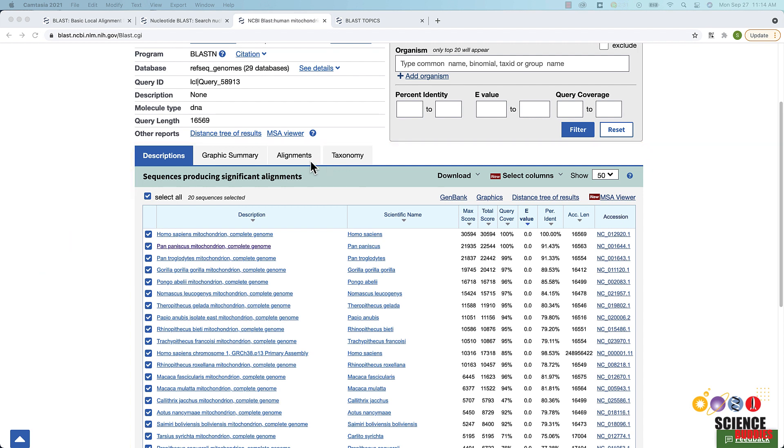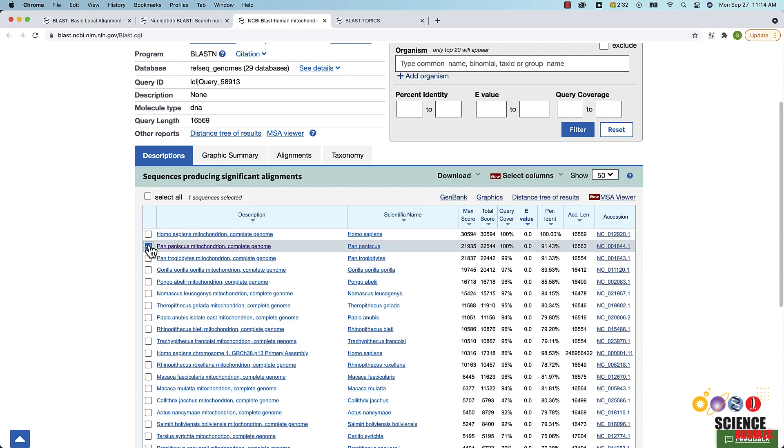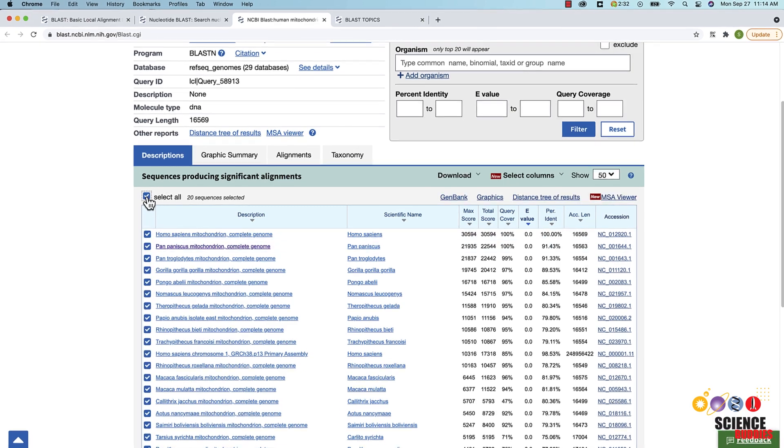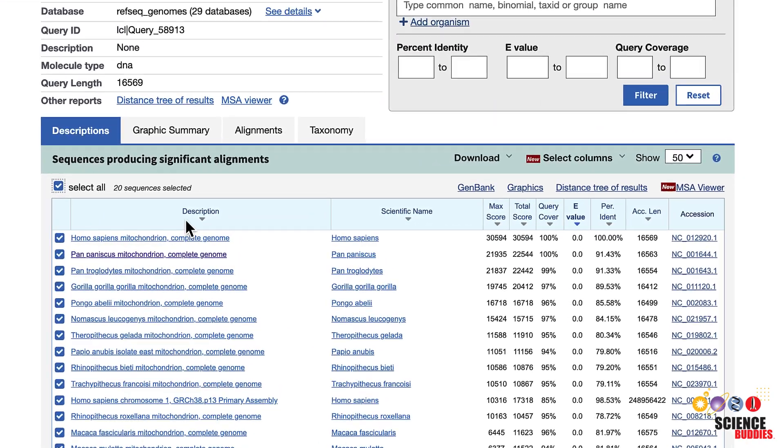The Description tab, which is the default tab, contains a summary table of hits found by BLAST. Each row in the table represents one database sequence that BLAST identified to be similar to your query sequence. You can use the checkbox in the top left corner to select all or none of the sequences. Individual sequences can be selected and deselected using the checkboxes to their left.